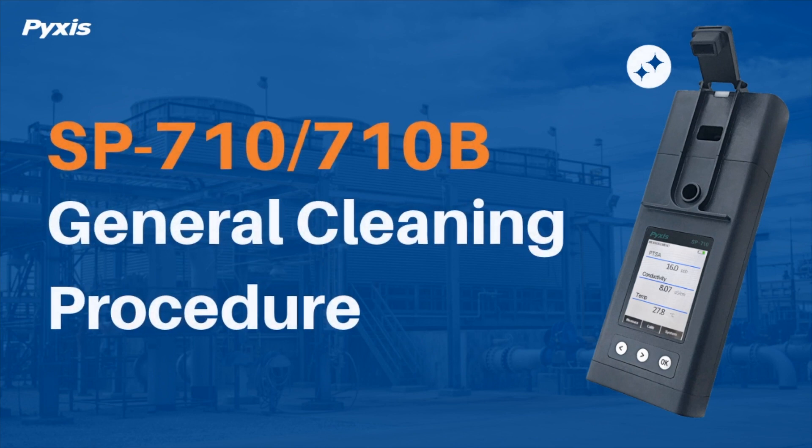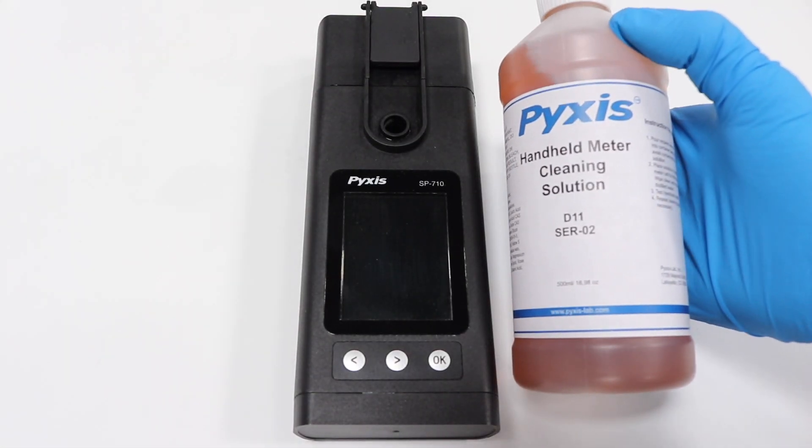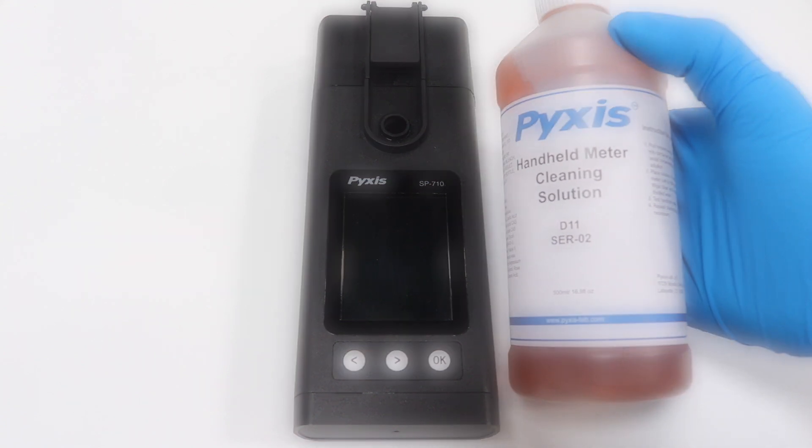This video demonstrates how to properly clean your SP-710 or 710B handheld water multimeter. To complete this process, you'll need Pixis Handheld Meter Cleaning Solution, available at pixis-lab.com.